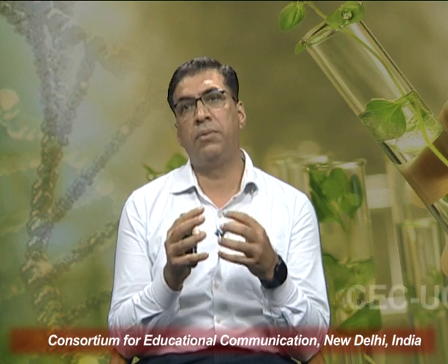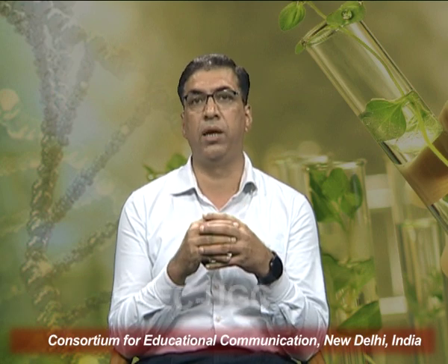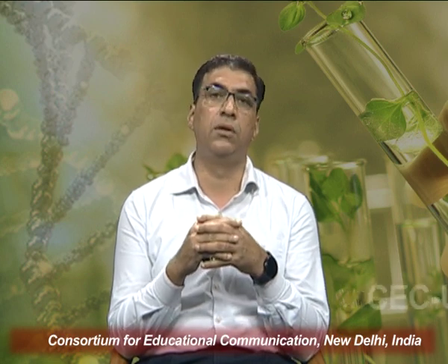Now there are certain limitations of turbidostat continuous cultures as well. It has been found that on the optical surfaces of the detector, sometimes the foam of media gets deposited or certain precipitates get deposited over a period of time. Some microbial growth occurs on the optical surfaces of the photocells.